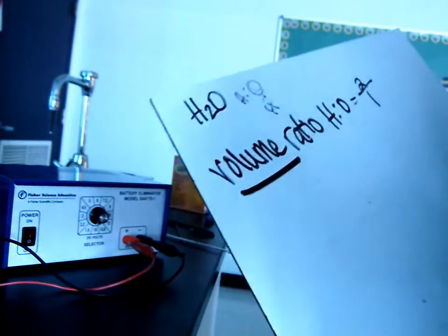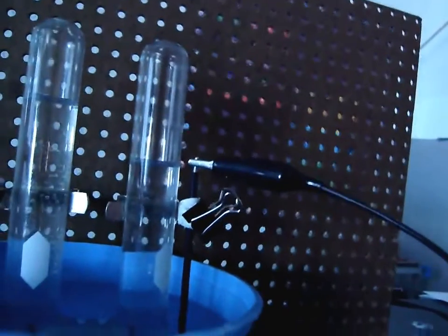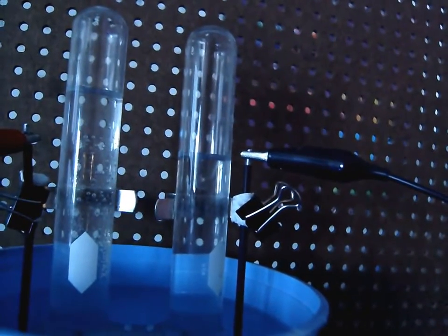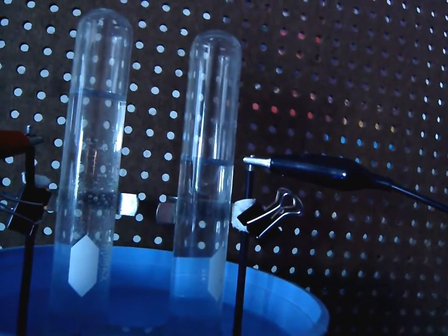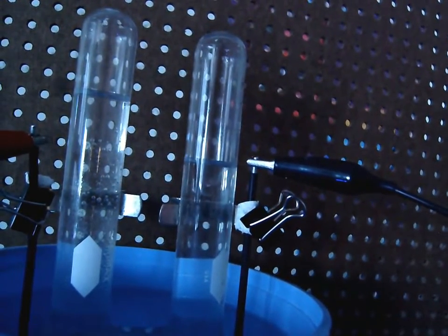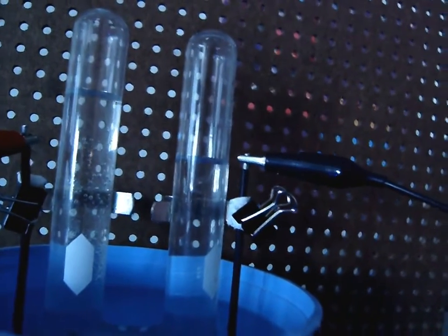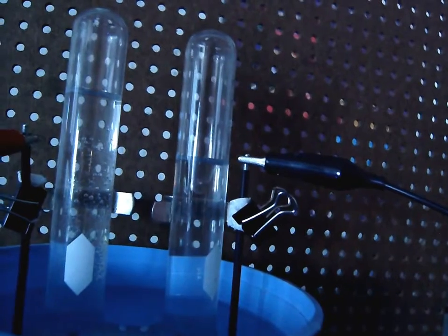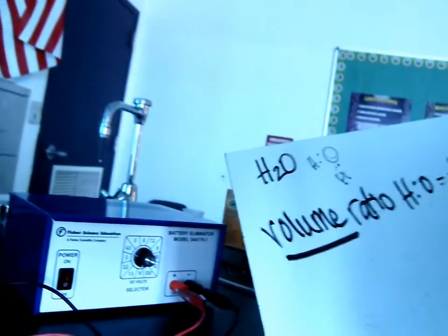So again, if we were to look back over here at our test tubes, you can see that the test tube on the right has a much larger volume of gas than the test tube on the left. So the test tube on the right is hydrogen and the test tube on the left is oxygen. Okay, so hydrogen is created in double the amount, at least in terms of volume, double the quantity, double the volume of oxygen. So that's where we get our volume ratio, 2 to 1.